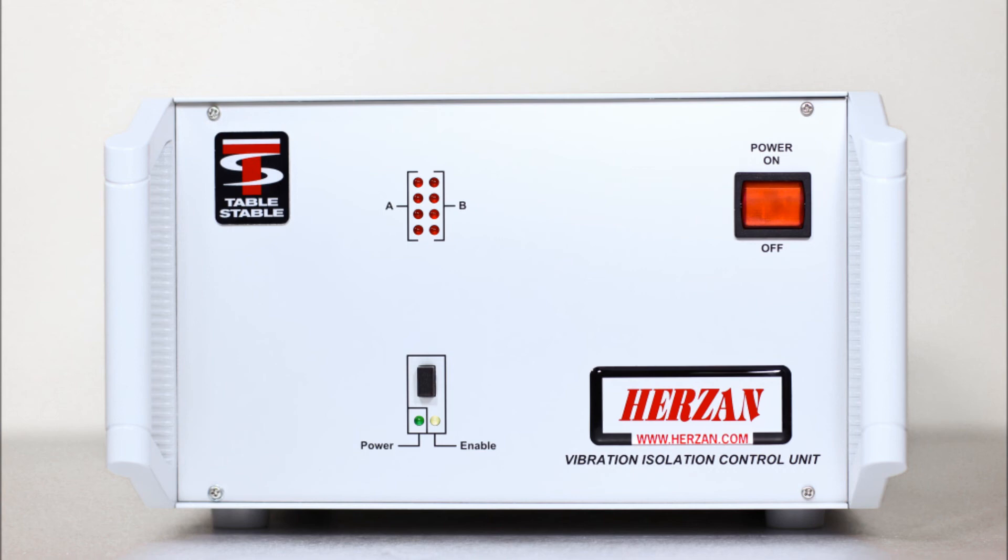After 30 seconds of powering on the AVI controller, press the black button to enable the active isolation component of the AVI platform. The yellow indicator light will now stay permanently on, indicating the AVI platform is actively isolating.